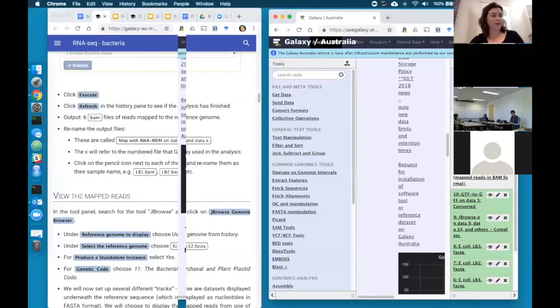There's a question on the discussion board about the difference between the p-value and the adjusted p-value when we look at that output with our list of genes sorted by the adjusted p-value. In a really general sense, the adjusted p-value means it's been adjusted for multiple testing. So that's the one we want to look at. It's also sometimes called the false discovery rate, or FDR. So if you see FDR or adjusted p-value, that's the thing we want to look at when we look at this table of genes.